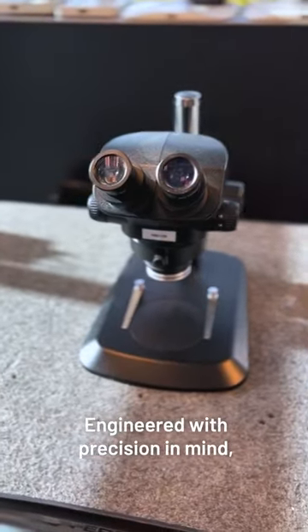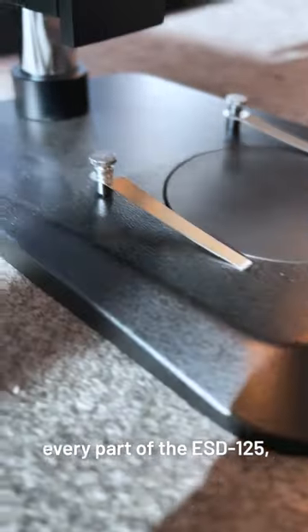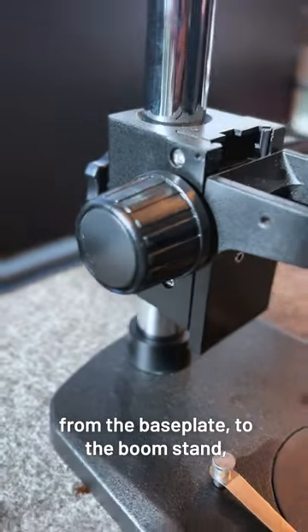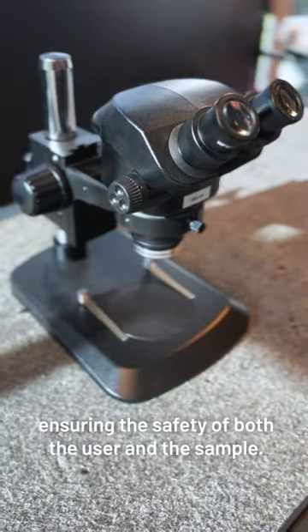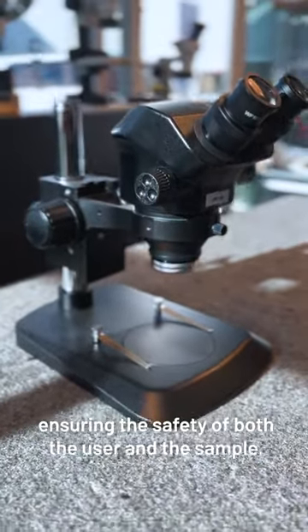Engineered with precision in mind, every part of the ESD125 — from the base plate to the boom stand to the body itself — is ESD safe, ensuring the safety of both the user and the sample.